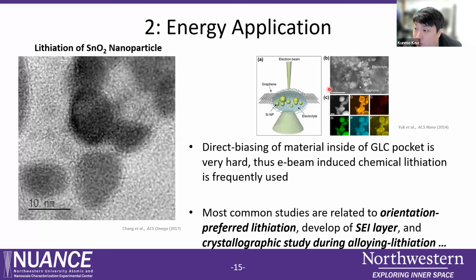So in terms of imaging with the TEM acceleration voltage, if we are using high electron volt energy, we get more transmission and the contrast will be minimized. If you are using low electron voltage, the transmission will be reduced, but the contrast will be increased. So we normally use somewhere between 200 or 300 kV. That is just okay with the TEM. But if you go with one mega electron volt, then it will be very hard to see some contrast in the GLC.